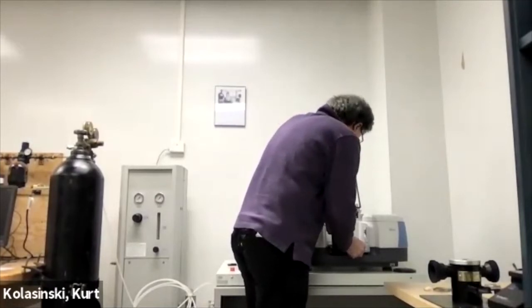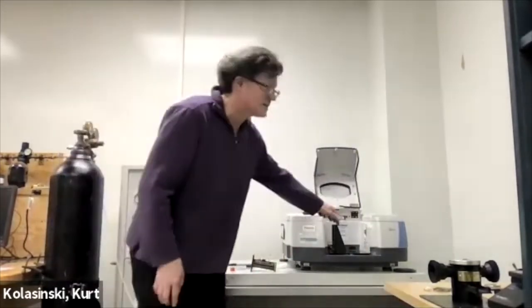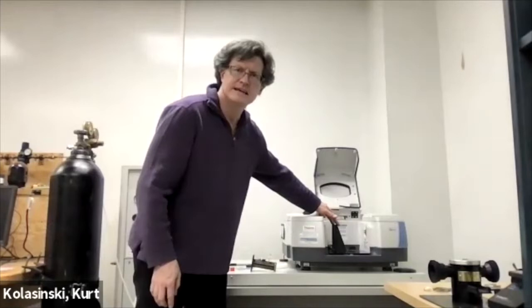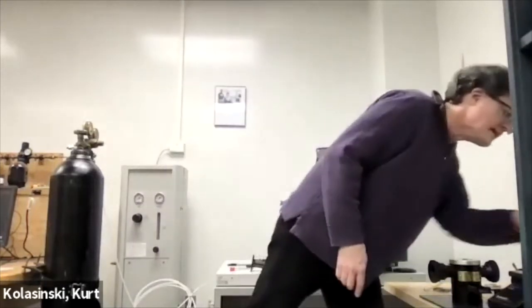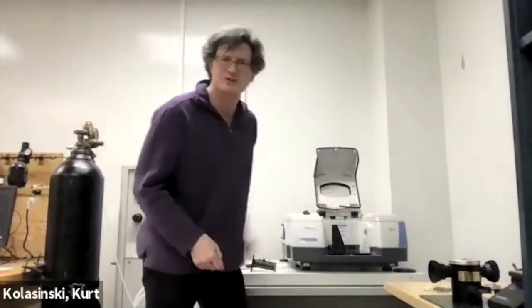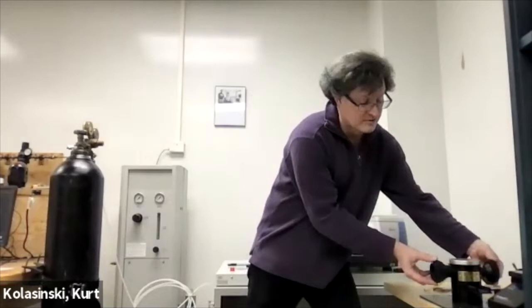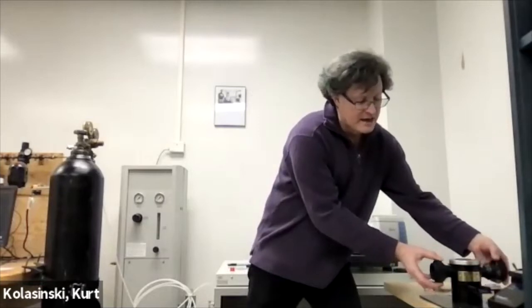Okay. There we go. And those three in the back, that tells it which accessory is in there, except that these two don't actually have anything that mates up with that. Only the transmission one. Okay. Notice that on these, there are also these little styrofoam puppies.